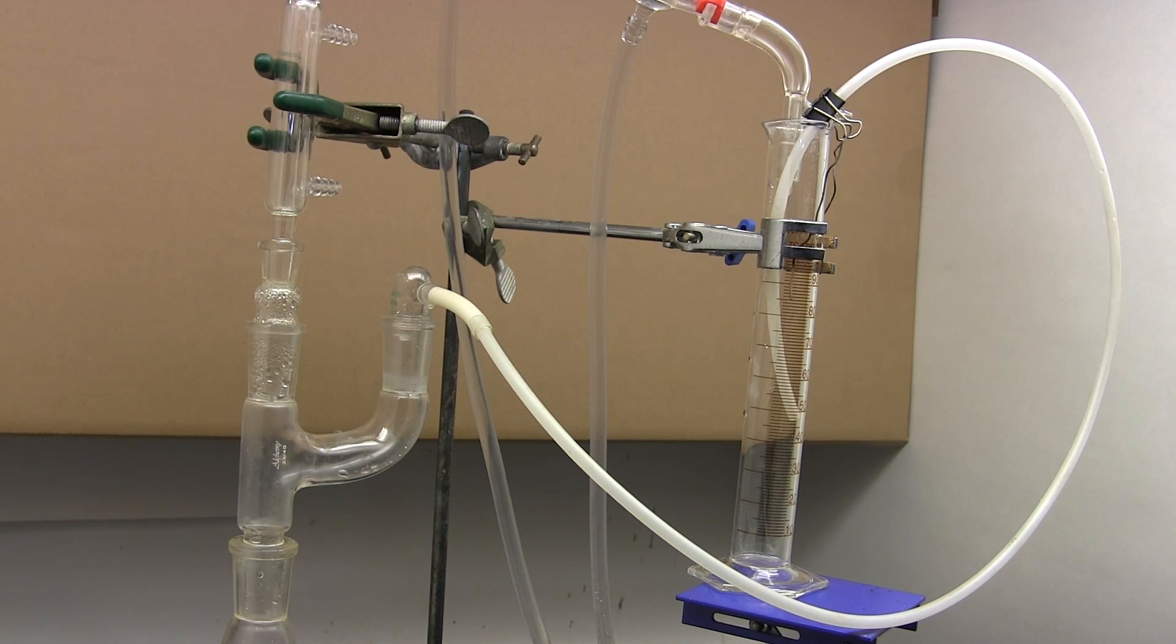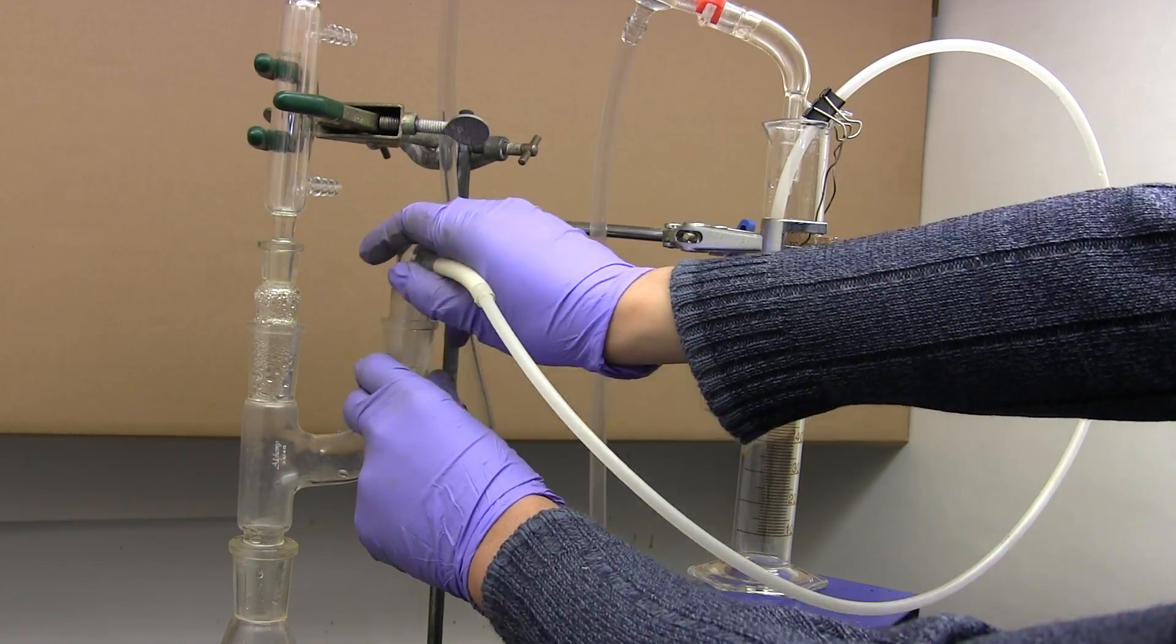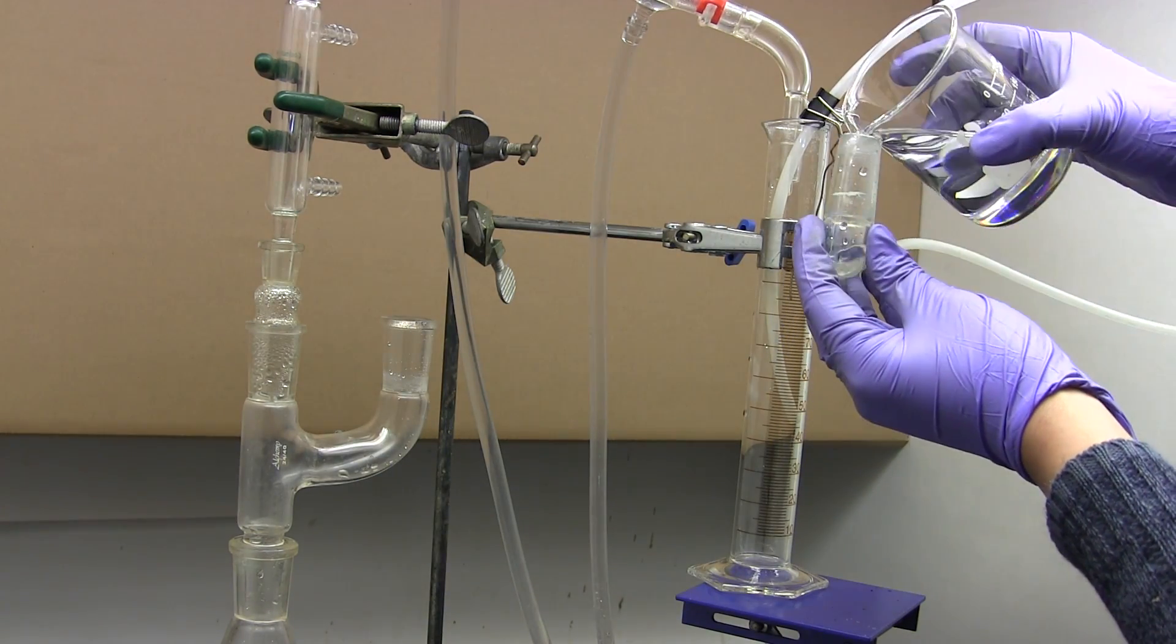Setting it up like this ensures the siphon will always work and withdraw fluid from the graduated cylinder, without over-emptying it and sucking in air that stops the siphon and causing it to overflow later. Now you need to pre-fill the tube in the graduated cylinder with the carrier fluid.